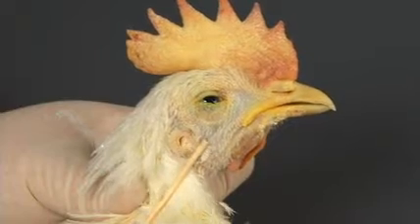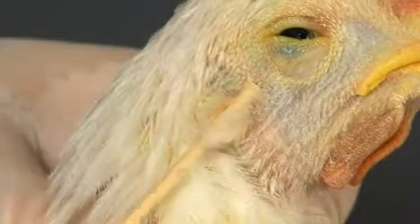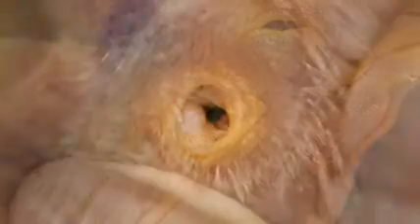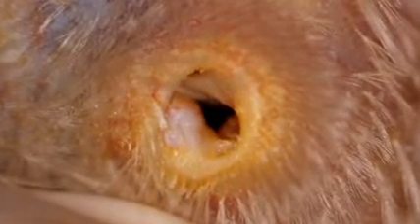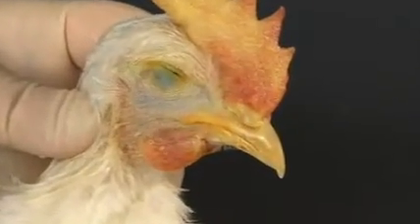Examine the external ears, located caudal ventral to the eyes. The ears are located under short, stiff, covert feathers. The ears are simple round ostia with no external pinna. The openings should be free of swelling, exudate, or other material. Examine the beak and cere.